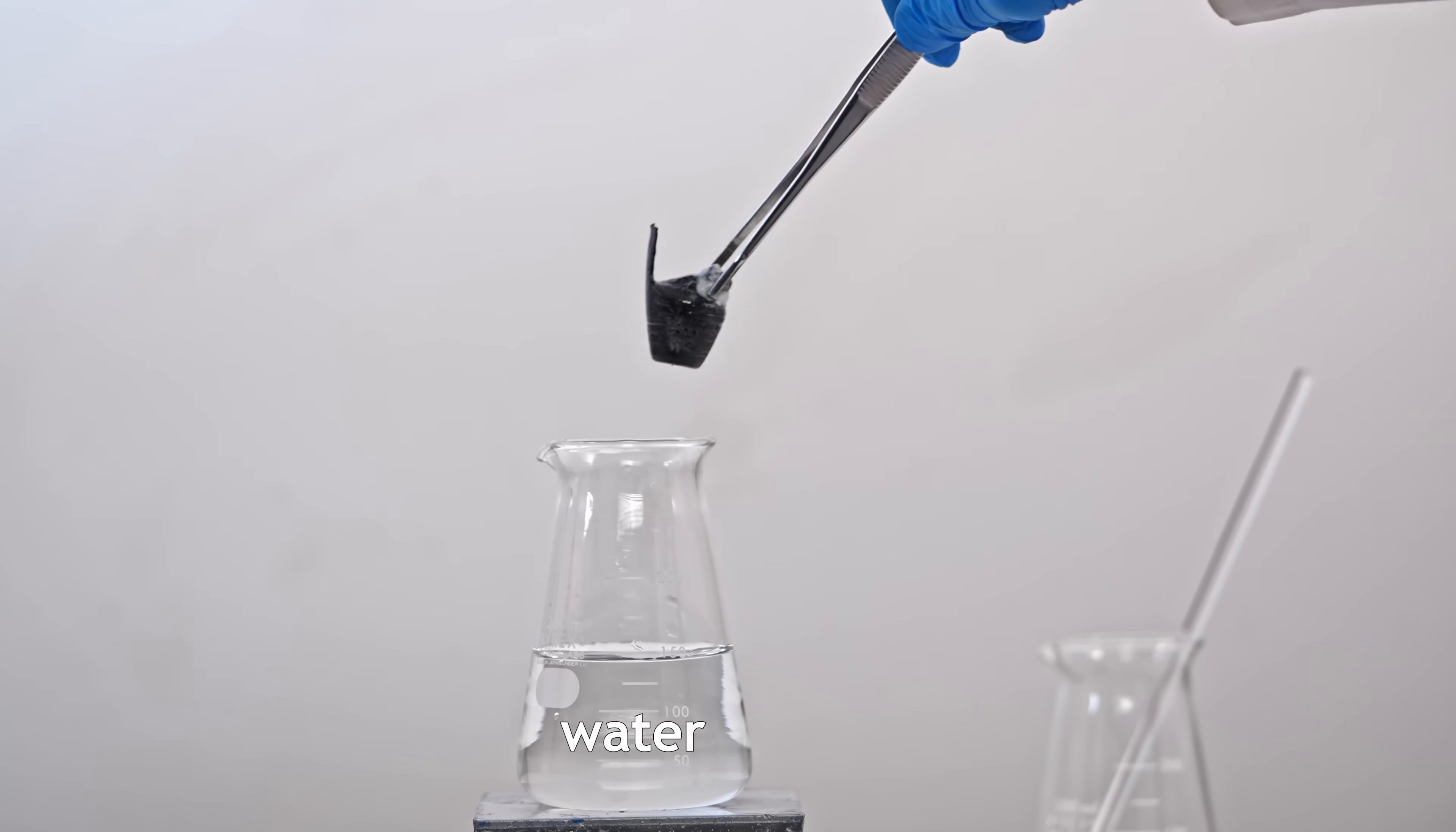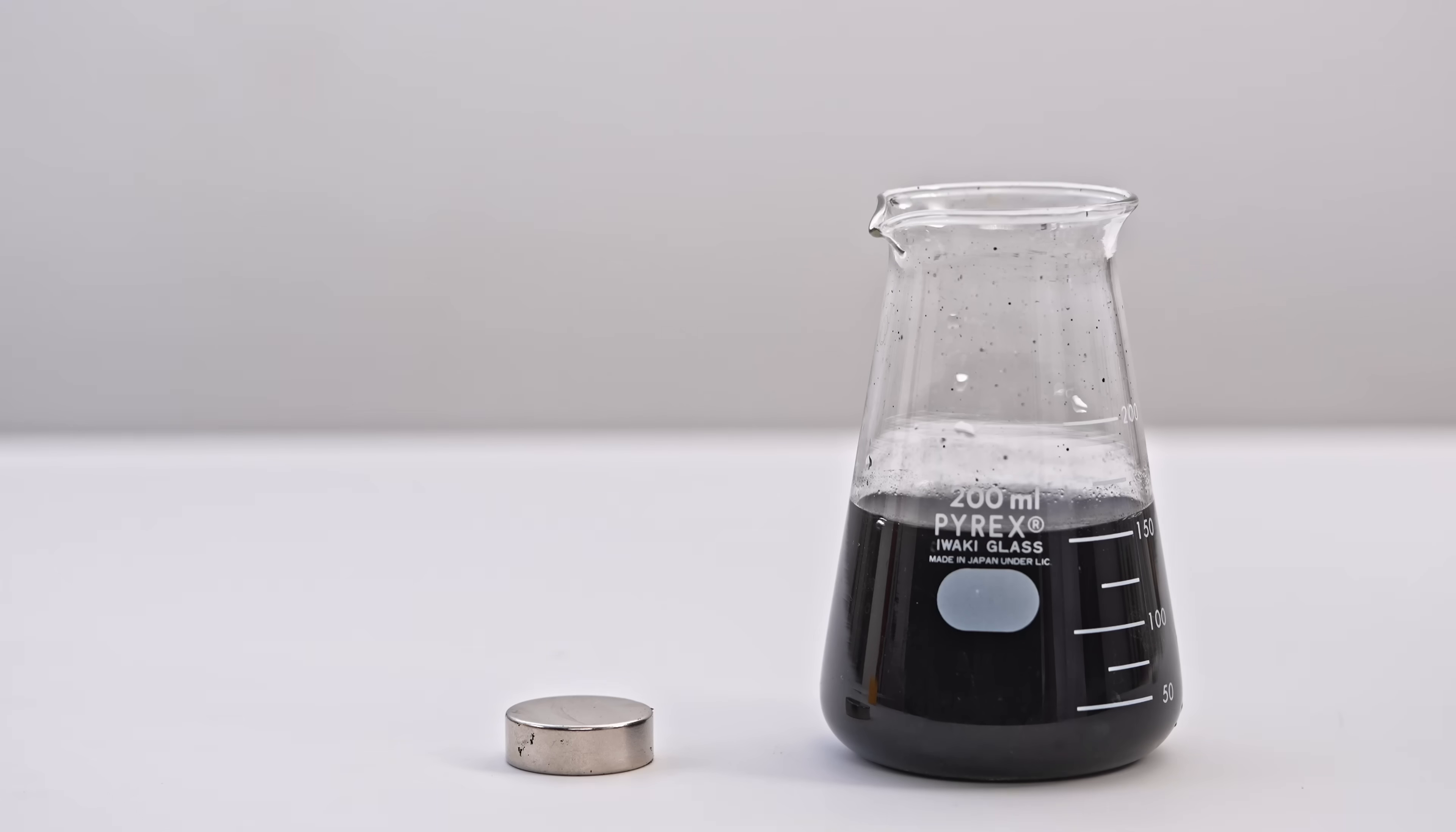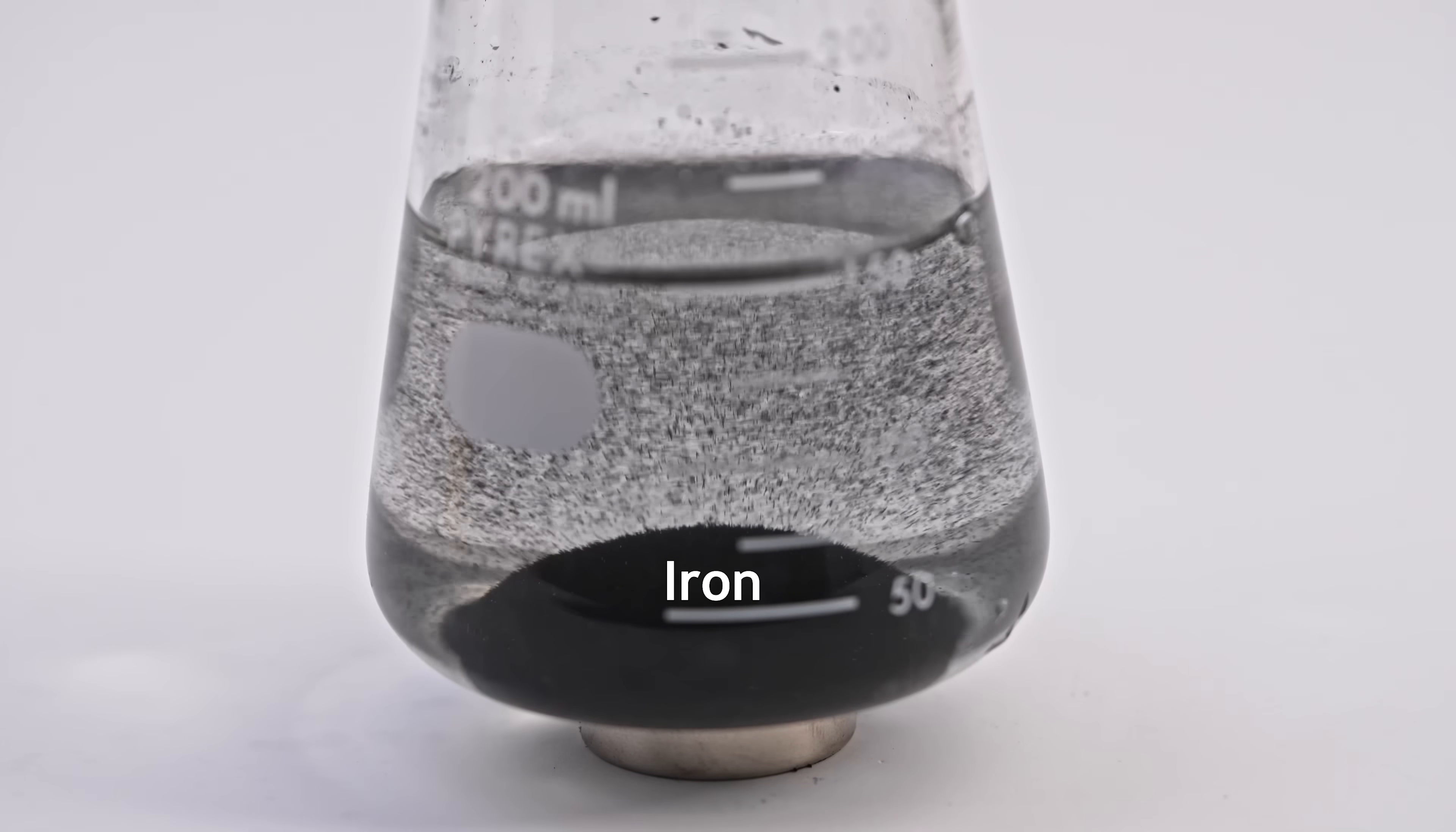I dissolve it in water to separate the insoluble iron impurities, which we can collect using a magnet. If we place it on a magnet, all the iron will quickly collect at the bottom of the beaker, which will simplify the task of filtering this solution.